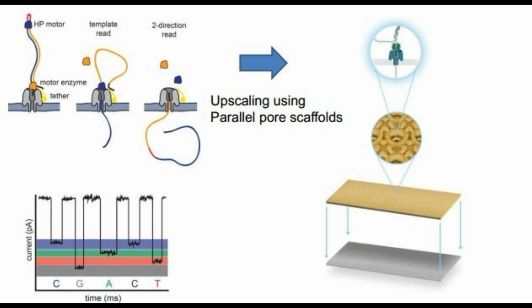The buffer that contains the ions travels across this membrane through the nanopore, hence creating a current. As the DNA passes through the nanopore, the flow of ions changes. This creates a current signature depending on the DNA sequence. And this we can detect and correspondingly determine which nucleotide has just passed through the nanopore.